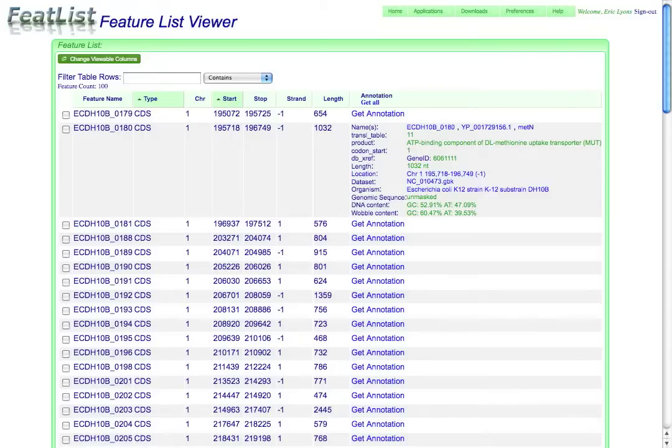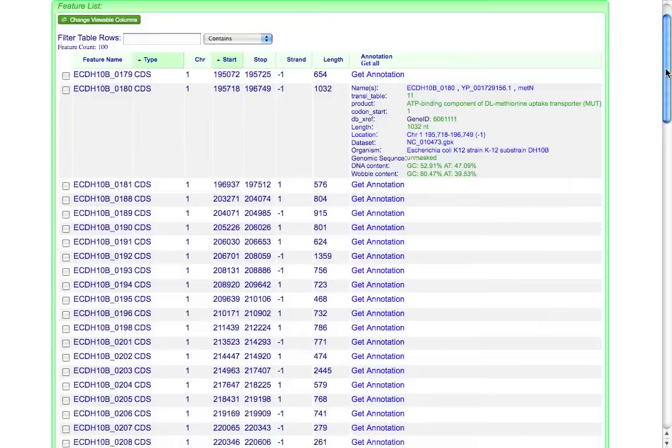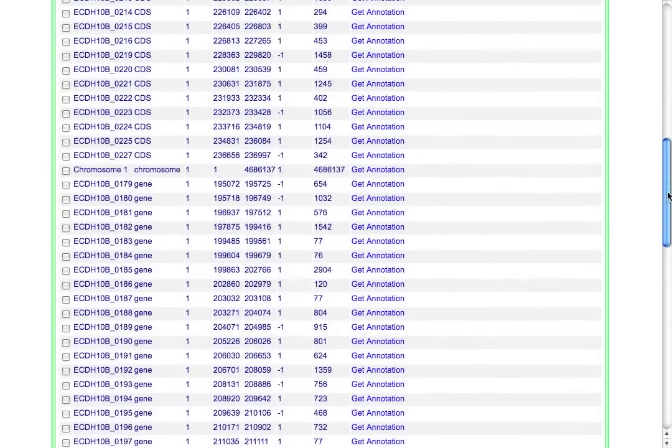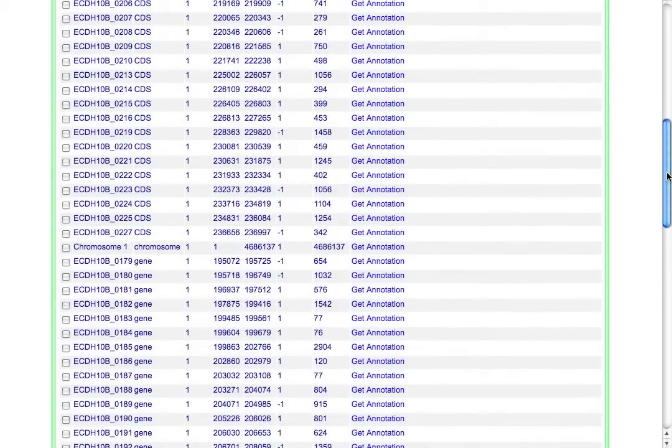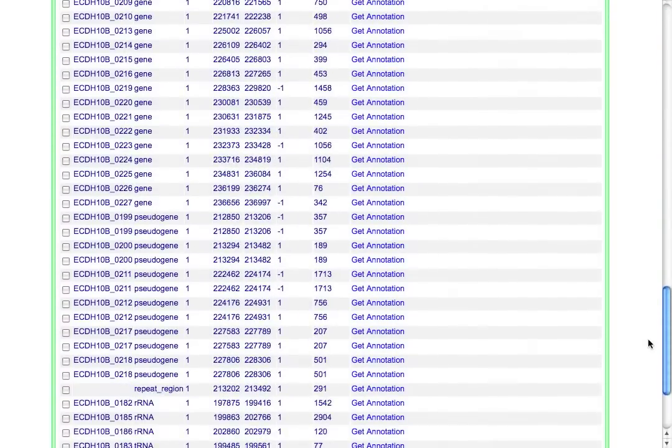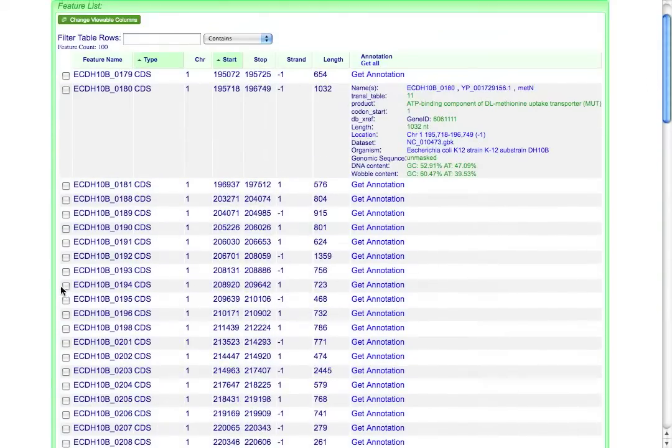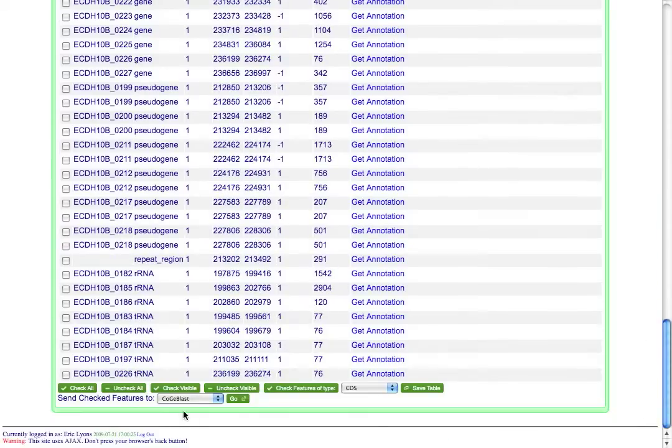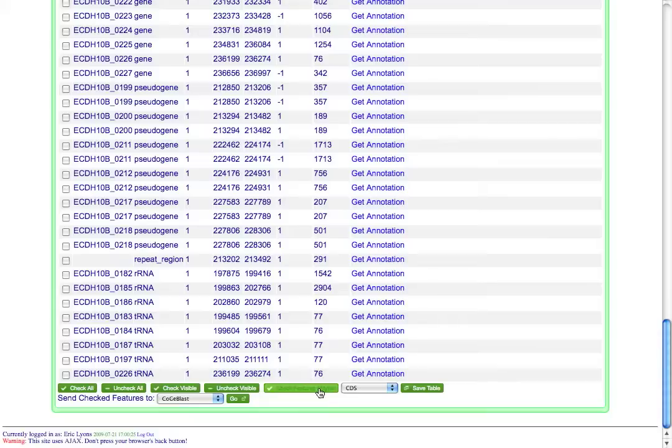So in this case, I'm not really interested in all of these features. I'm just interested in the protein coding features. So there are these checkboxes that I can use to select individual features that I'm interested in, or there are a whole bunch of options at the very bottom of the list, such as check all features of type CDS.